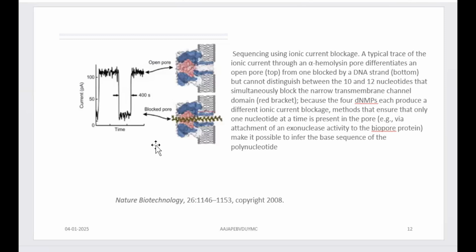When it comes to advances in solid state nanopore materials, an electron irradiation based technique for silicon membrane nanopore preparation is developed. So to increase the conductance detection, that is the signal detection, can be maximized, and you can reduce the baseline noise.